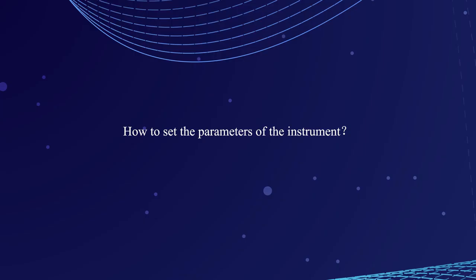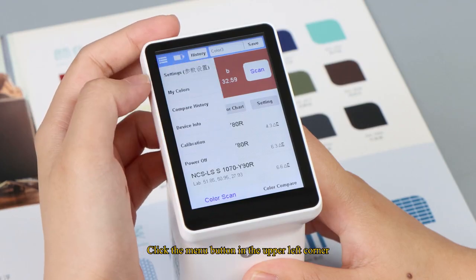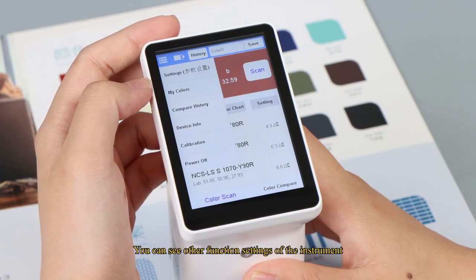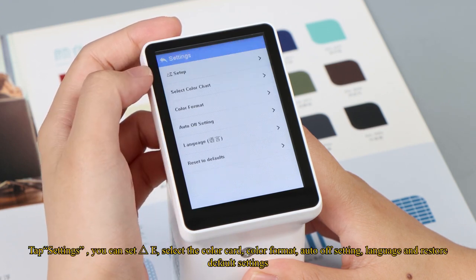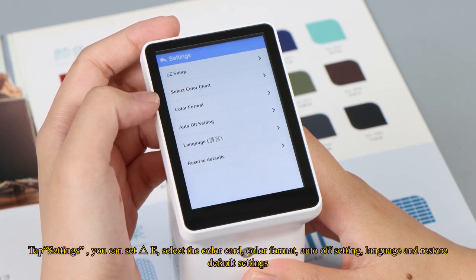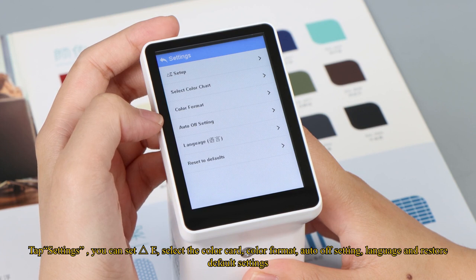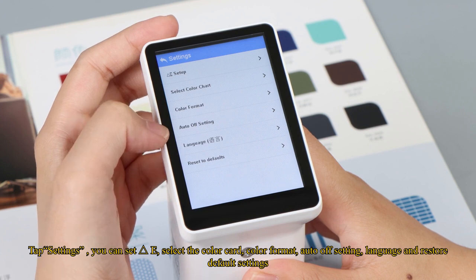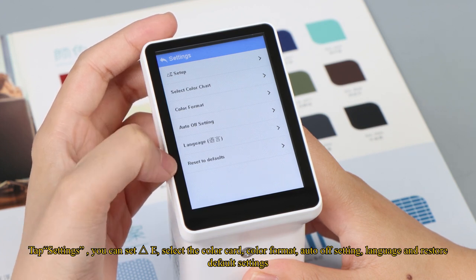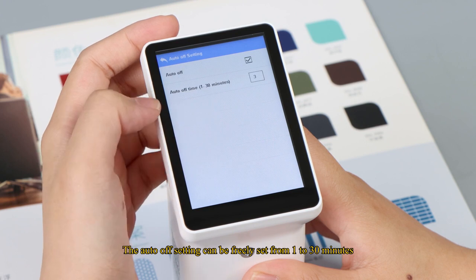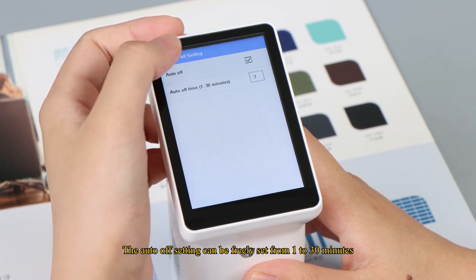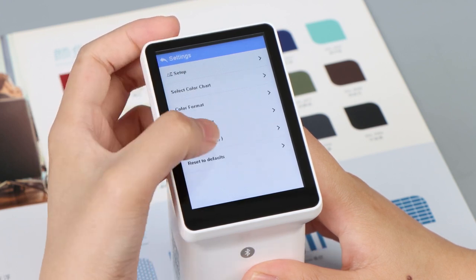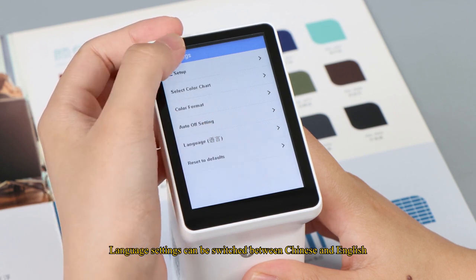How to set the parameters of the instrument. Click the menu button in the upper left corner. You can see other function settings of the instrument. Tap settings, you can set delta E, select the color card, color format, auto off setting, language and restore default settings. The auto off setting can be freely set from 1 to 30 minutes. Language settings can be switched between Chinese and English.